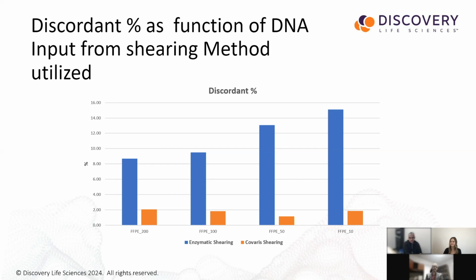This matters for our success rate of sample processing, especially for these precious clinical trial core needle biopsy samples, which often also require macro dissection to generate meaningful data with very little background noise, that can give you the confidence of whether or not you should be trusting it, or how much bias is there in the data set. Coupled with both steps of implementation, I think it's a very good model for us.